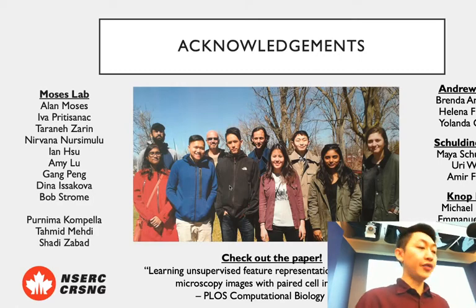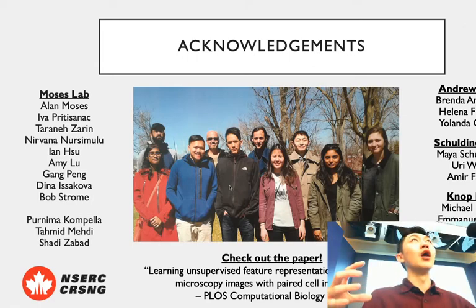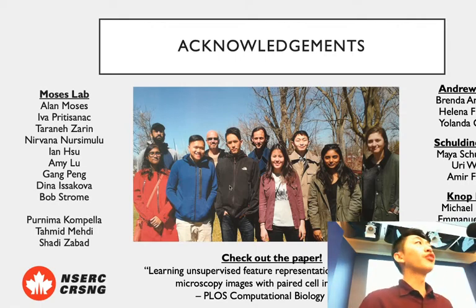From my perspective, within this field it's very popular for people to build classifiers, but we often have to understand that we're biologists, right? We often operate with incomplete knowledge, or we don't know our classes, or sometimes we have misconceptions about our classes, for example, we think what is one class is actually two subclasses. So although the classification metric was a good proxy for us, we didn't want to rely too heavily upon it because we don't think it reflects underlying biology, right?